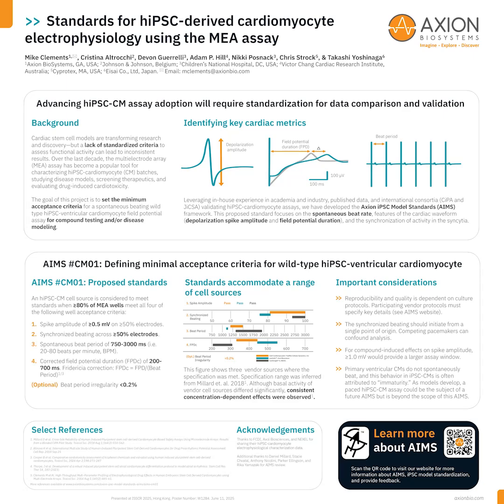Recently, the International Society for Stem Cell Research, ISSCR, released Standards for Human Stem Cell Use in Research, a document that outlines a set of recommendations that establish the minimum characterization and reporting criteria for working with human stem cells. The overarching goal of these criteria is to standardize practices and in doing so improve the quality of results. But there are still no agreed upon minimum acceptance criteria for the functional activity of iPSC-cardiomyocyte models.